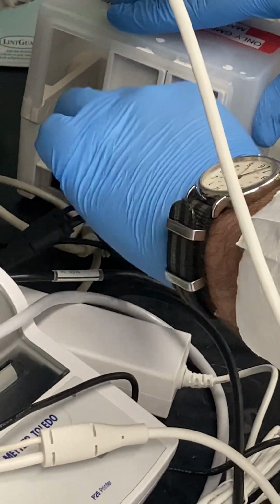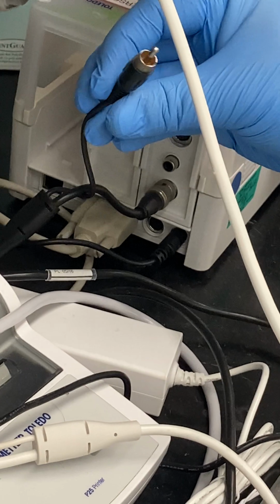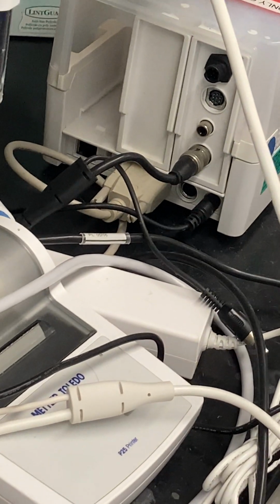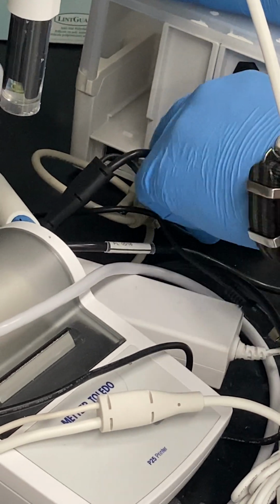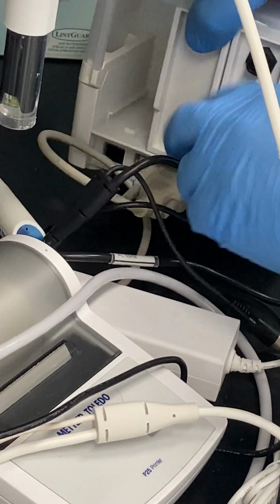The connections for the probes are optional, not on every probe. There's a little connector like this. You can see the label on there, maybe. It's ATC, the temperature correction. Gotcha. So that'll be the stuff that's in there.